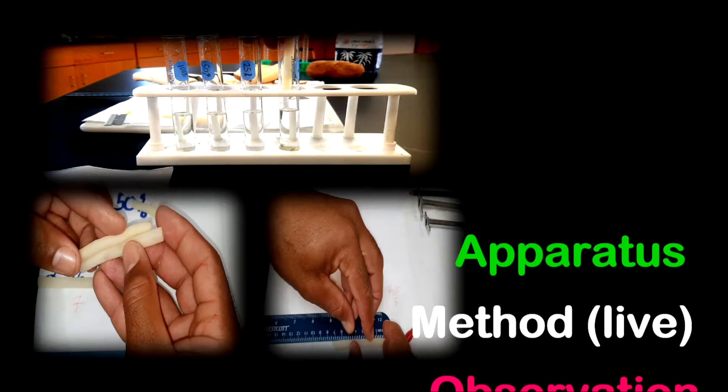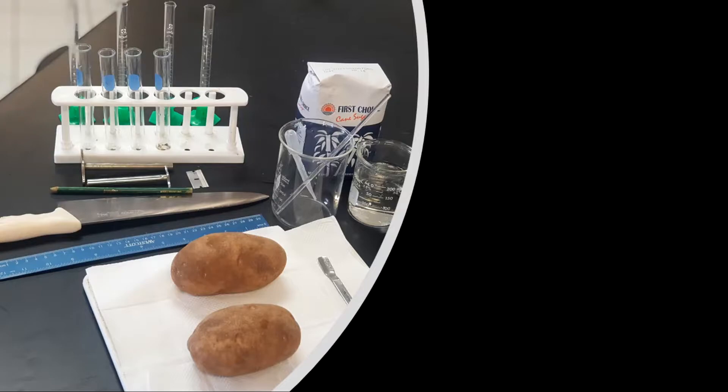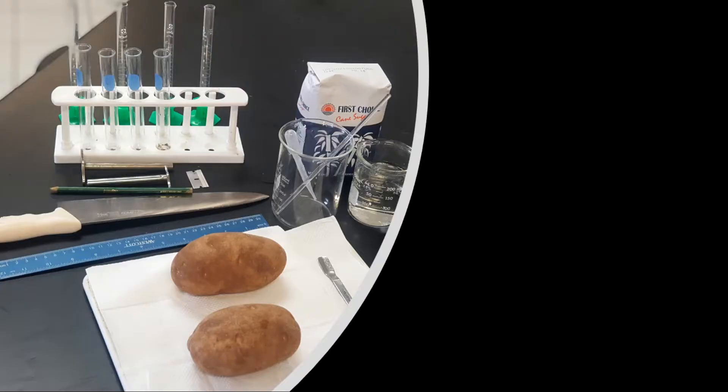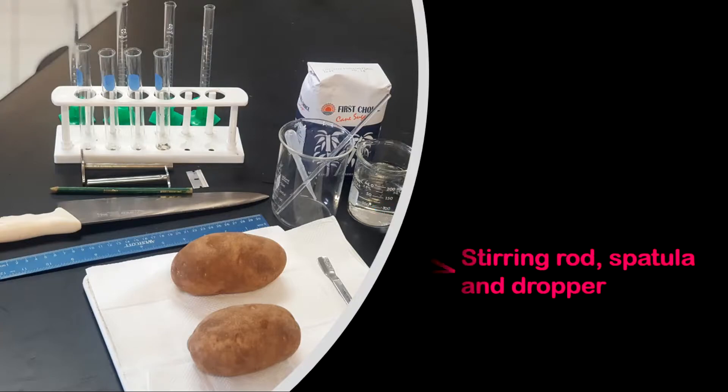Let's jump into the apparatus. You're going to need a measuring cylinder — I have four measuring cylinders, but you can use one. I like to use different measuring cylinders for my different concentrations so I don't cross-contaminate. You also need four test tubes and a test tube rack to hold them. You need sugar, a beaker, water — I recommend distilled water — and also a stirring rod, spatula, and dropper.